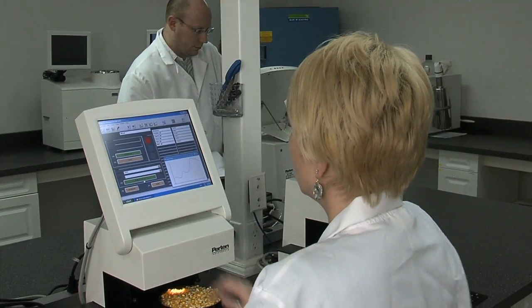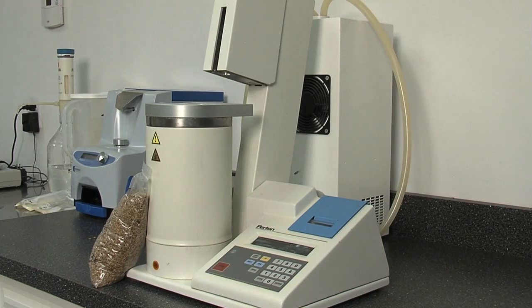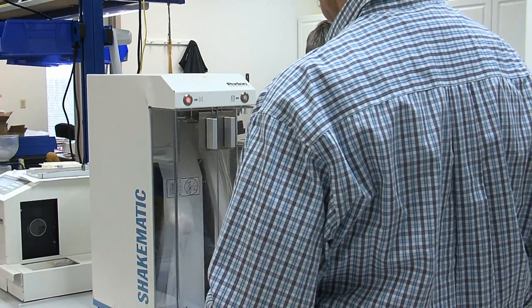For decades, the global grain industry has relied upon the innovative analytical technology from Perten Instruments.